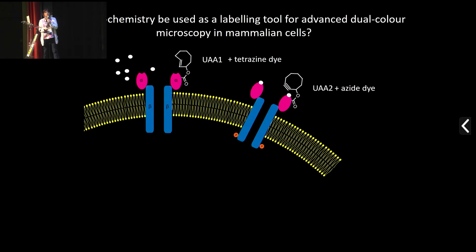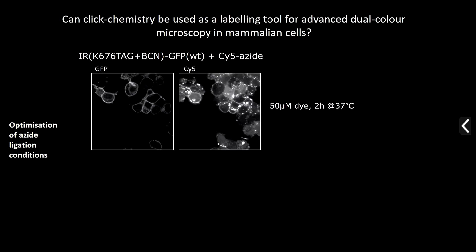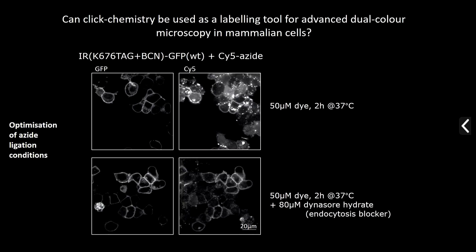We were curious to combine the two chemistries — tetrazine and azide ligation — to get dual-color labeling in mammalian cells. This was half successful: the tetrazine ligation worked well, showing insulin receptors on the surface of HEK cells, but the azide ligation under similar conditions gave us nothing. Because the azide ligation is much slower, we tried optimizing — increasing dye concentration and waiting two hours — but this resulted in a lot of non-specific labeling and endocytosis. Blocking endocytosis gave more specific labeling, but high dye concentrations and a two-hour wait is not ideal for fast live cell labeling.